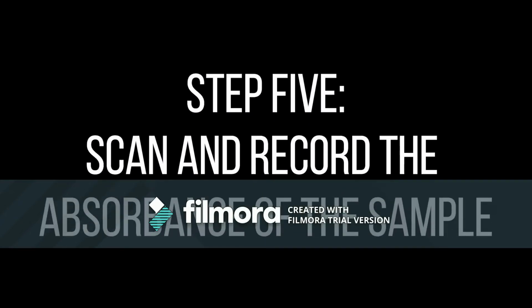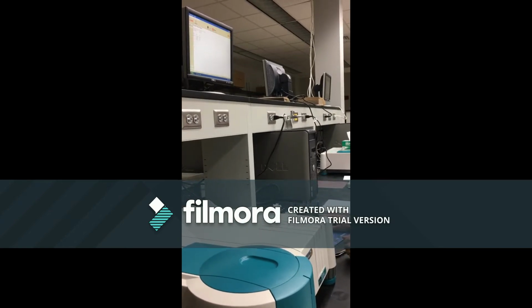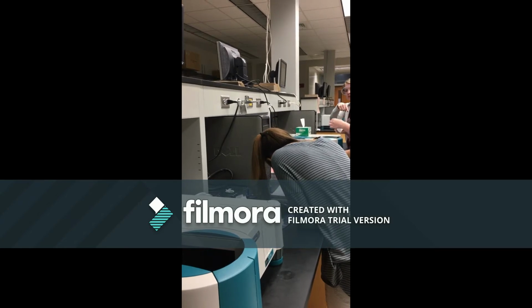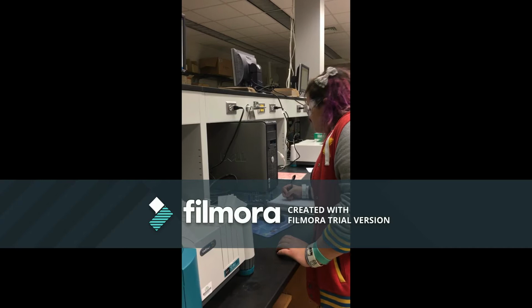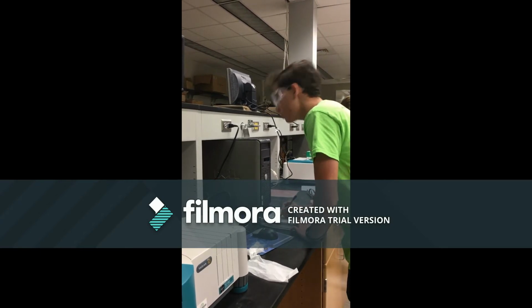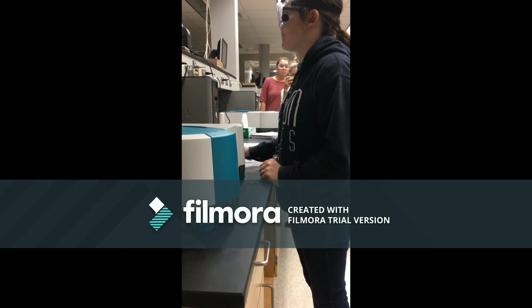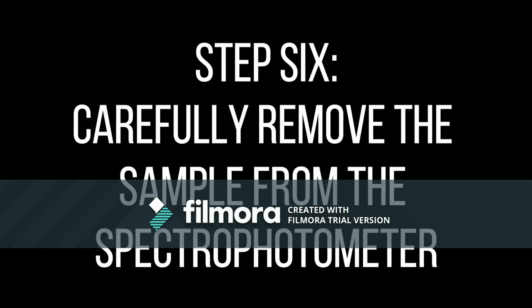Step 5. Scan and record the absorbance of the sample. Step 6. Carefully remove the sample from the spectrophotometer.